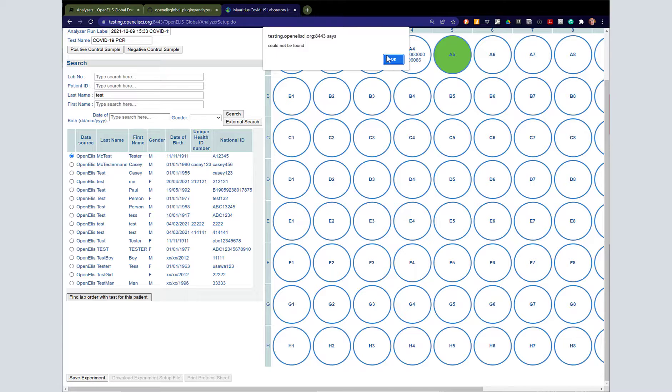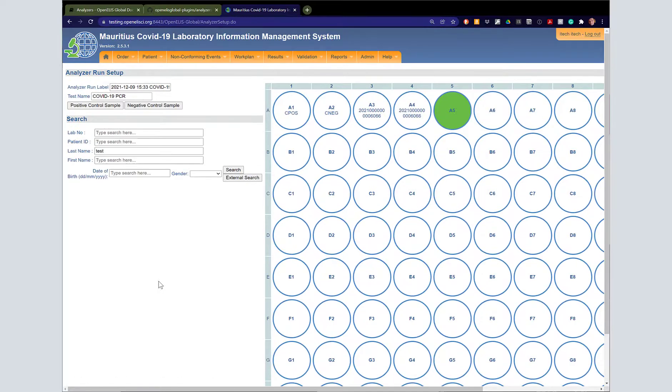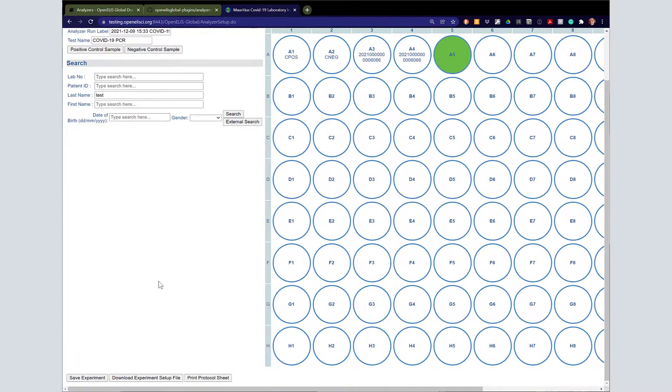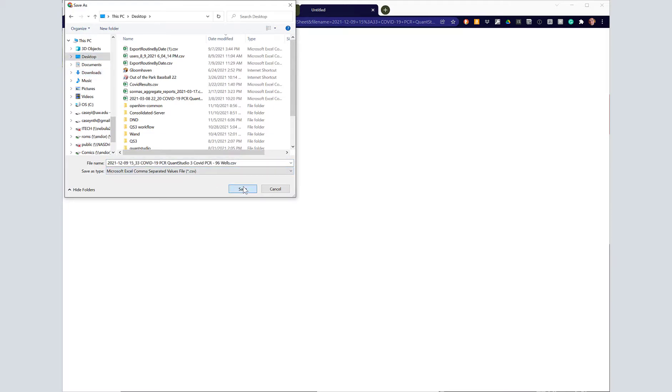We've got a few things in there. We can go ahead and click Save Experiment, which saves it in that setup. You can resume part way through. Now we're going to go ahead and go over to Download Experiment File. This gives us the CSV with the plate setup that we just finished.